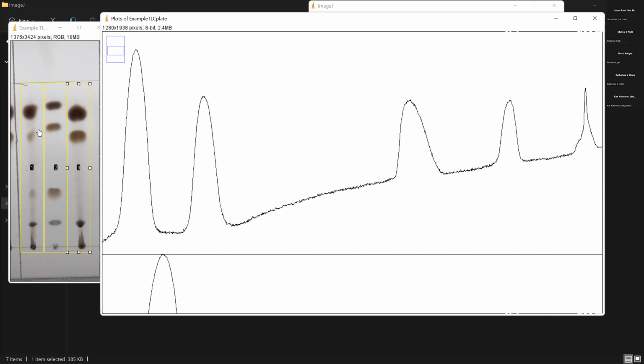Okay, so this dot here is going to correspond to this here, and that is going to be your cholesterol esters. If you look on page 79 in your lab manual, you'll see a mock-up diagram of what the TLC plates look like, and it helps you identify which one's which. So this top dot corresponds to this peak, that's cholesterol esters.